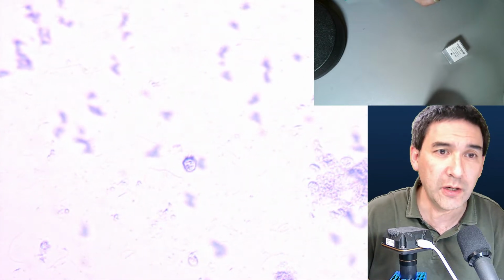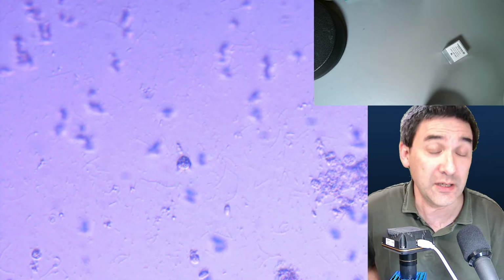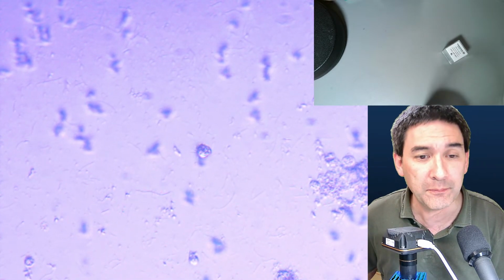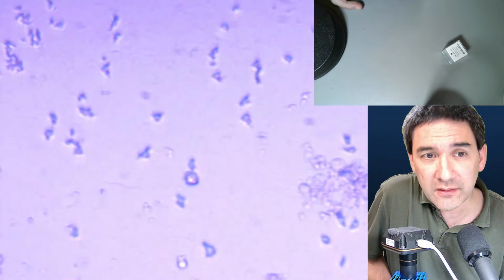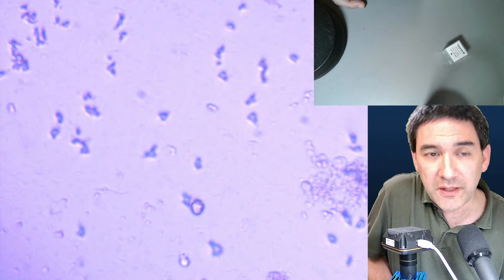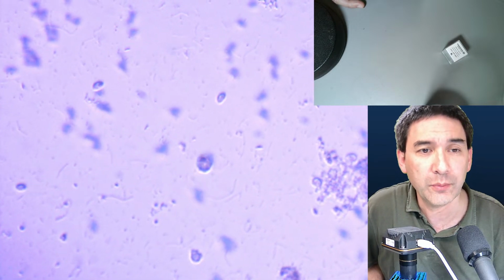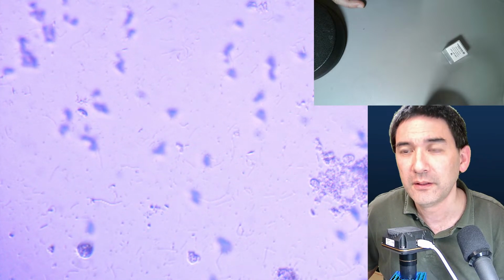So this is basically how it looks. Again, there is somewhat of an internal in the tube, oblique. Look, this is actually quite nice. When the lamp is from the side a little bit, then it looks a little bit 3D. So that's a form of oblique illumination as well. It also illustrates that you can get different lighting techniques even though it does not have a condenser. The image quality would of course be much higher with the presence of a condenser.